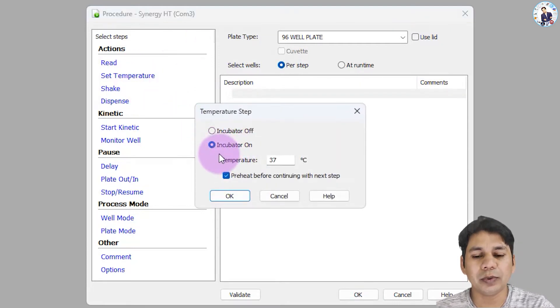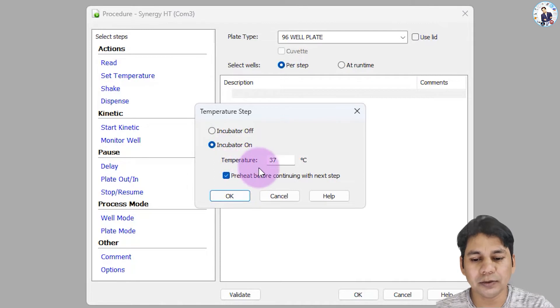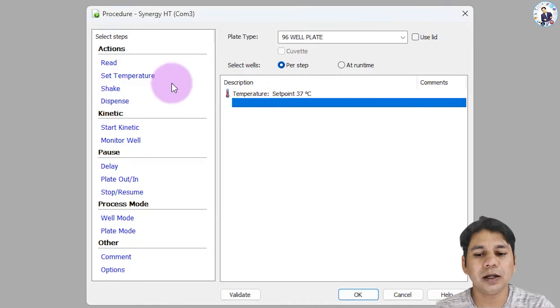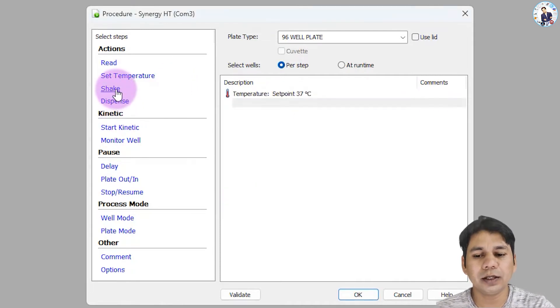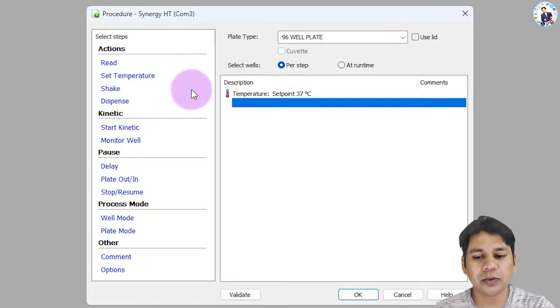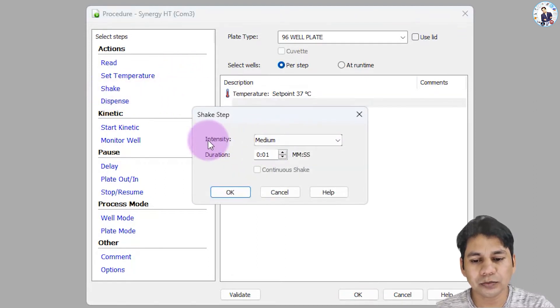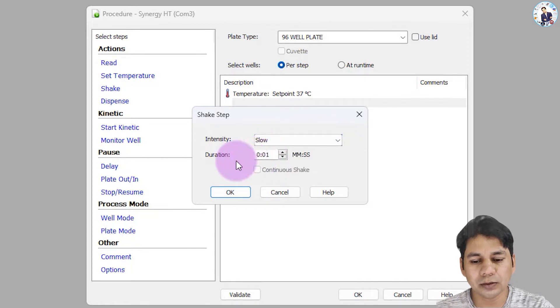The requirement for this assay is 37 degrees centigrade. It also needs shaking of the plate, so I am selecting shake with intensity slow and duration of two seconds.